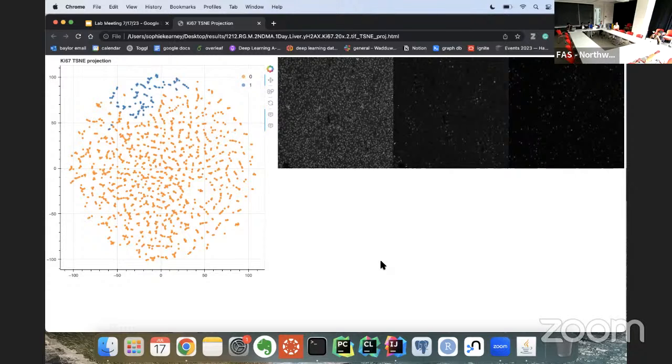So you have 34 of them. And you can draw parallels to this experiment, right? In this experiment, there are a few types of mice. Let's say for simplicity there are two experimental conditions. Take one type of mouse model, and some are exposed to the toxin and some are not. Then you run this experiment, sacrifice the mouse, check the tissue, and do the staining. So for every animal, you have thousands of data points from every cell.